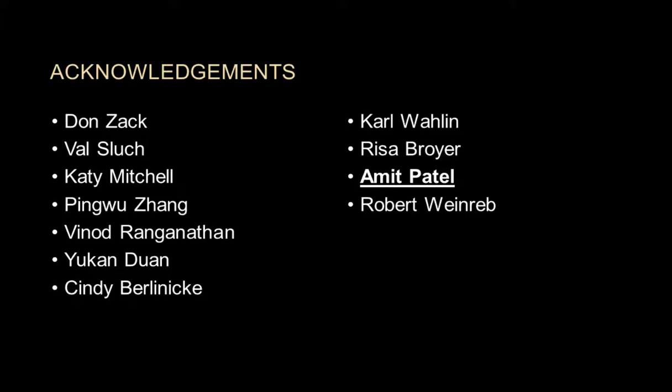Thank you. Our next question is, how do you choose your guide RNA targets? There's a variety of criteria that go into choosing our guides. There's a ton of websites out there that'll predict off-target effects. We have sort of gravitated towards using the Broad Institute's on- and off-target ranker. That gives us a general list of gRNAs. Now, because we are doing T7-based transcription, ideally our gRNAs would start with 3 Gs. So it'd be the motif GGG, N17, NGG.